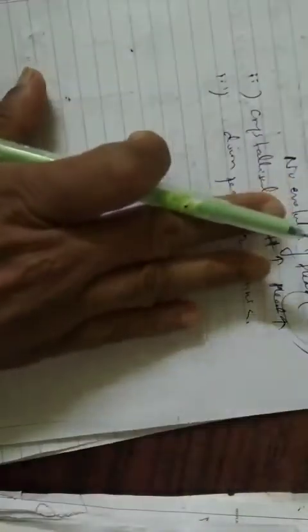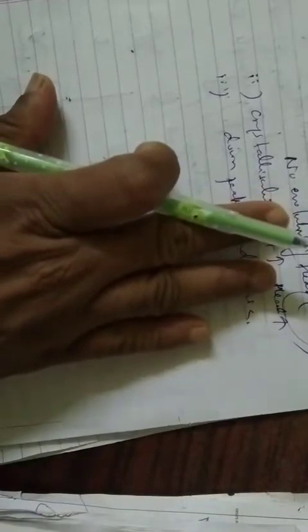Now this DTA is used, as we said, to study various physical and chemical changes that take place, and this is how, with the help of DTA, we analyze the changes.